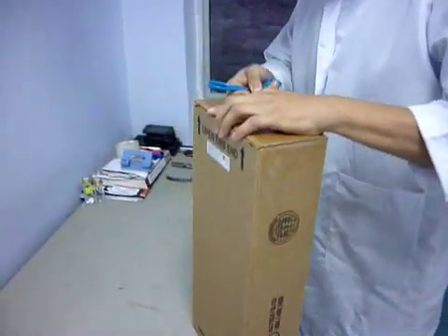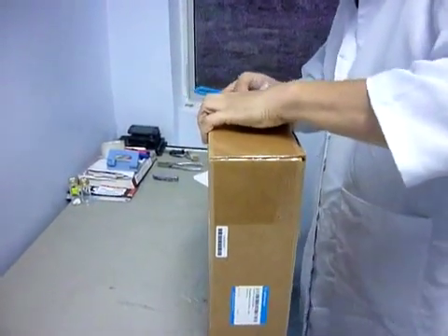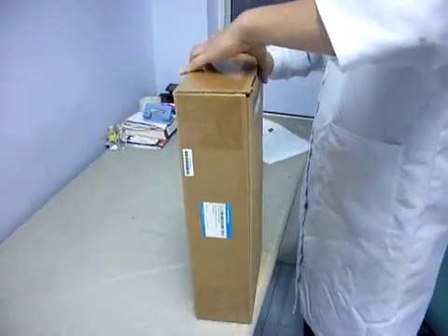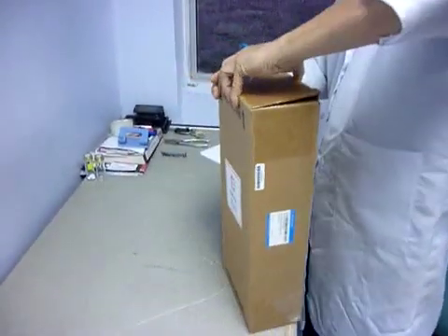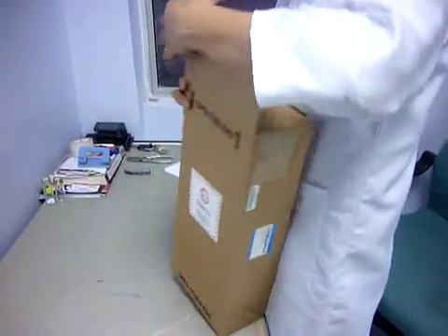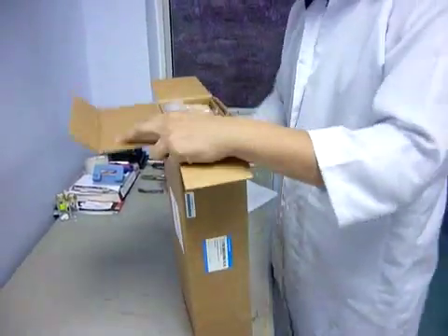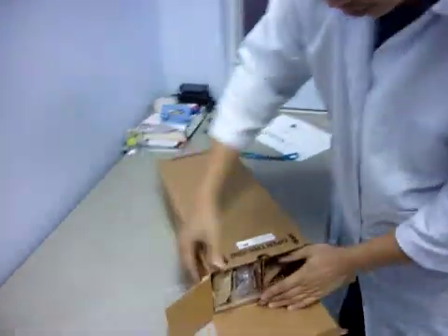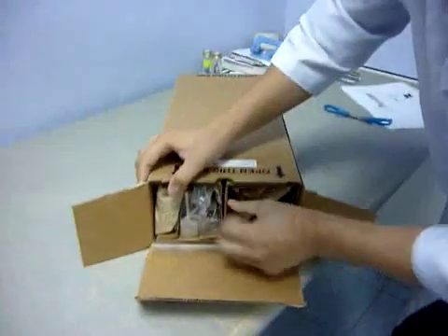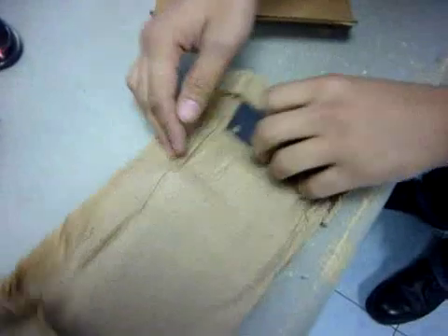This is new. So this is the inside content. This is the metal bracket.